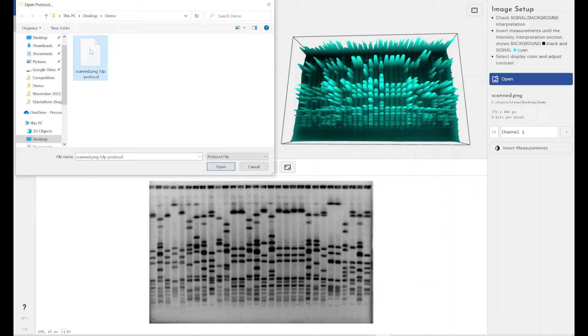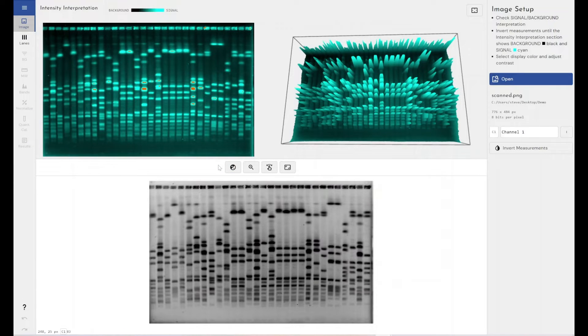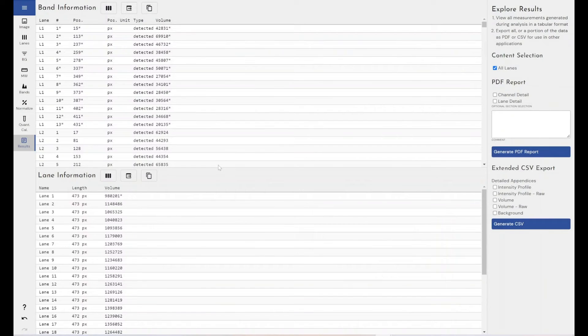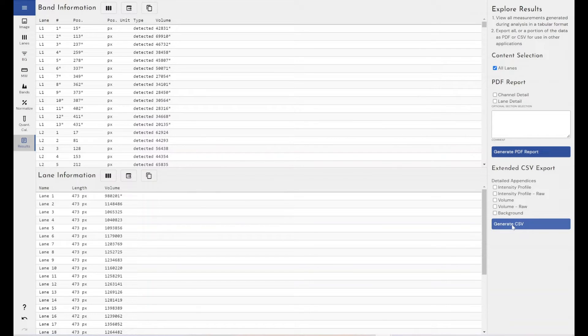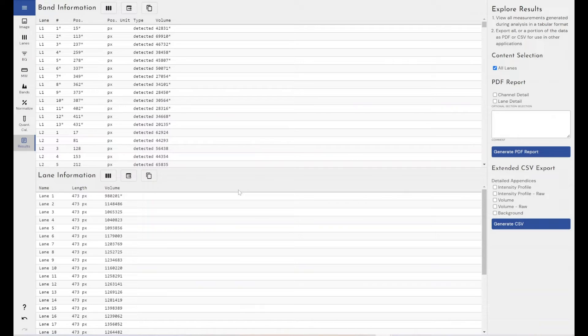And then I've got my protocol file here that I've preset up. Click on open and it takes me straight to the results section of this analyzed gel or blot, from where I can generate my PDF report or generate my CSV and take this data to another program or to do something else with it.